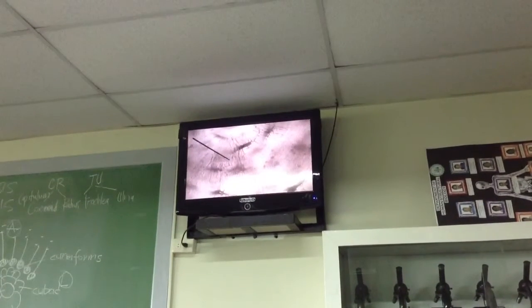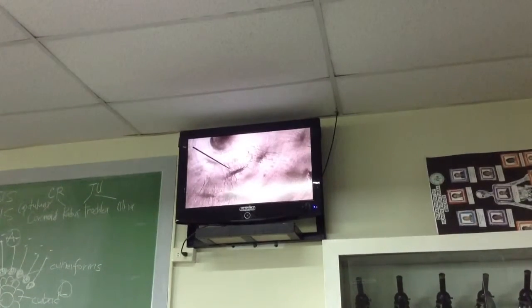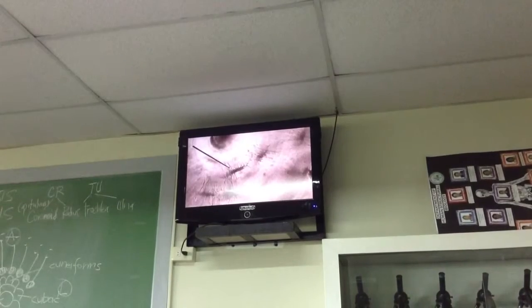So these osteocytes are shaped like an almond shape, or ovoid with dendritic processes. Yung dendritic processes nito are located within a tiny canal. We call it the canaliculi. Of course, you won't see it even at high power. You can just imagine the processes traversing through those tiny canaliculi.